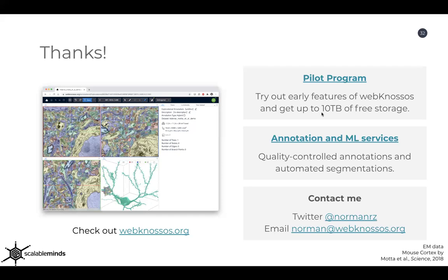Yeah. Hello, can you hear me? Yeah. Sure. Okay. Thanks for the talk, very interesting. When you've got multiple annotations on one region, I guess that gives you some information. If everyone agrees exactly, then it was an easy bit. If people don't agree so much, it's a bit harder. Is that information you can extract and use?